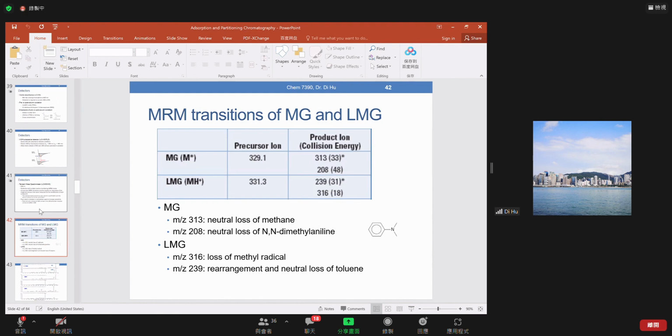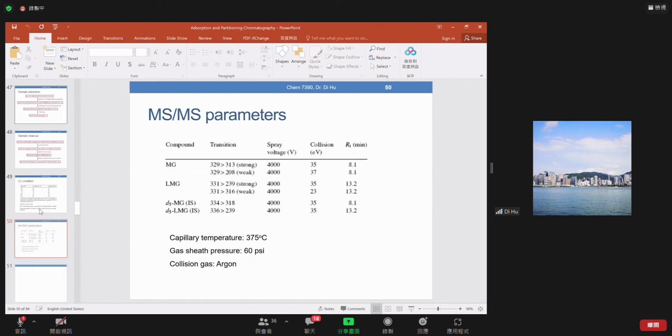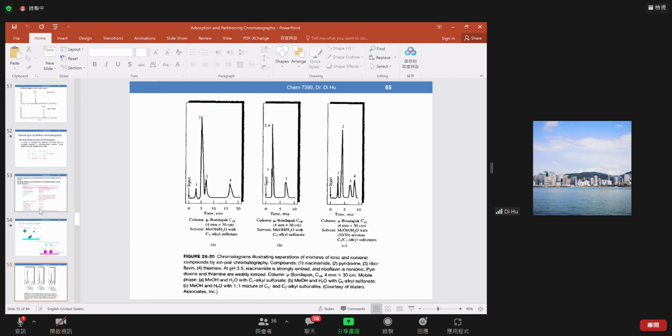Probably I will give you just one or two compounds. You look at the structure, and then I tell you what I'm expecting, and you're supposed to suggest and propose a procedure starting from the sample extraction to cleanup to the LC, the liquid chromatography separation, and also detection. Okay, and using those as examples, this already gives you pretty good examples.